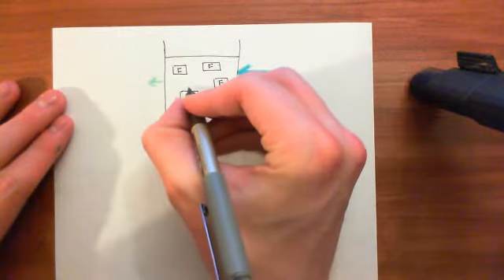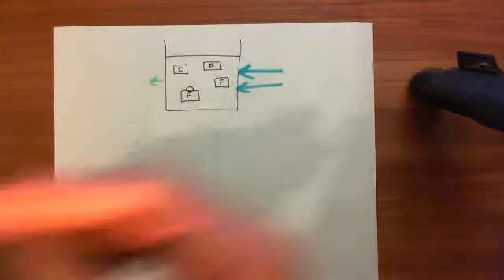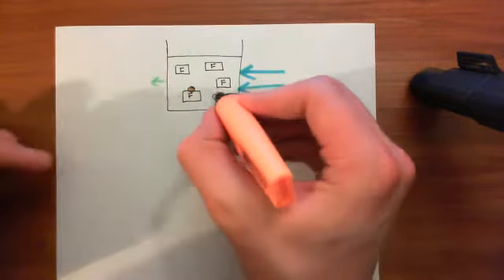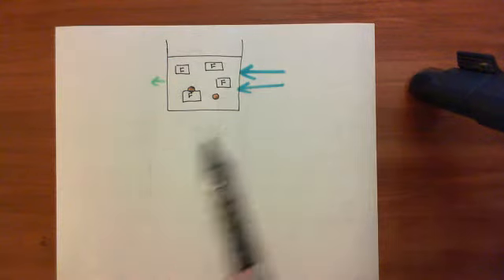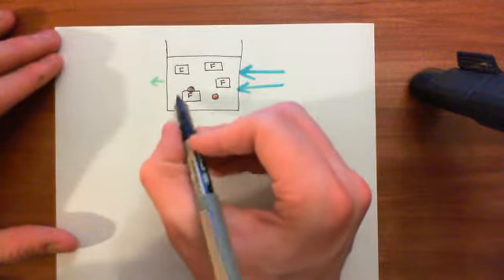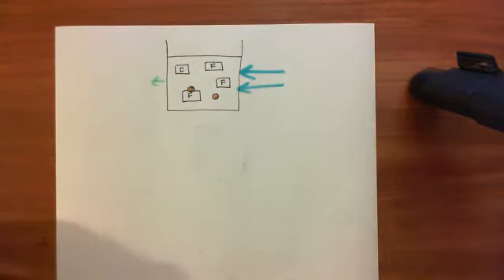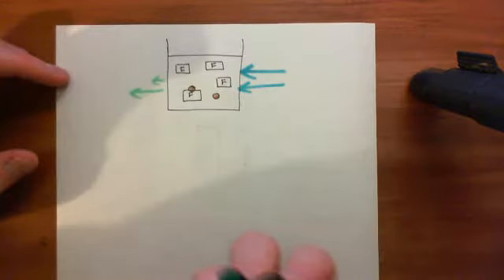So I add some calcium in, and some of the Fluo-4 molecules are now going to end up with calcium ions bound to them. Here is a calcium ion. There will be some free calcium ions, because not all of the calcium ions will bind to the Fluo-4 molecules. It will be an equilibrium, which we'll come back to later. So now some of the Fluo-4 molecules are better at fluorescing, which means that the fluorescent signal will have gone up, but it hasn't yet got to the maximum it could be.